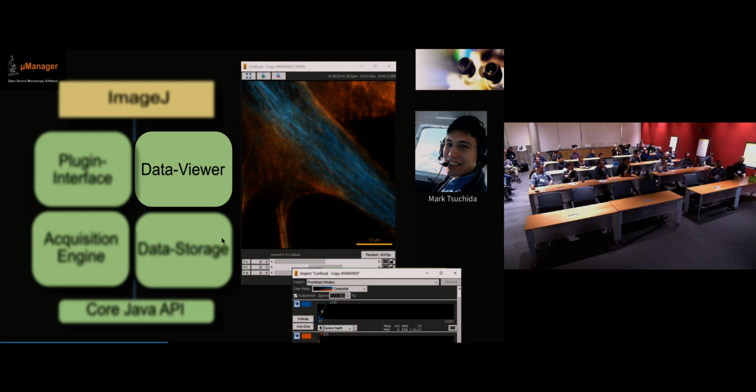So by now, that data viewer, I personally like it quite a bit. It has multiple axes, you can loop and play through these things. There are live histograms, you can graphically change brightness and contrast, there's gamma, you can put size bars on, timestamps, you can see all the metadata everywhere at any point in time.